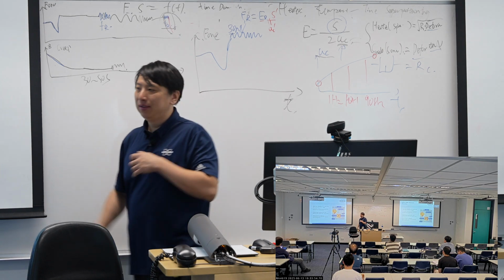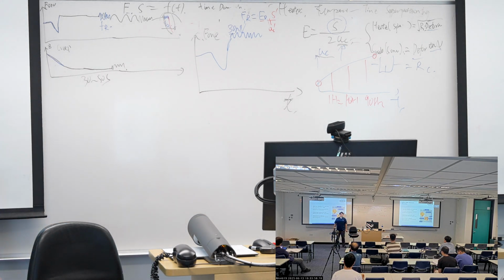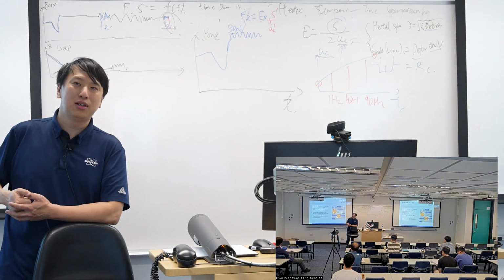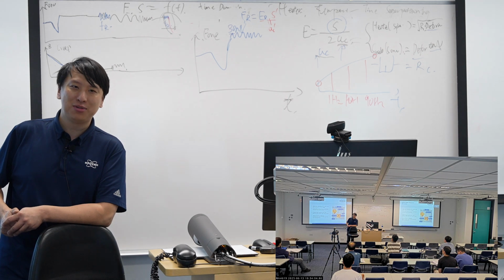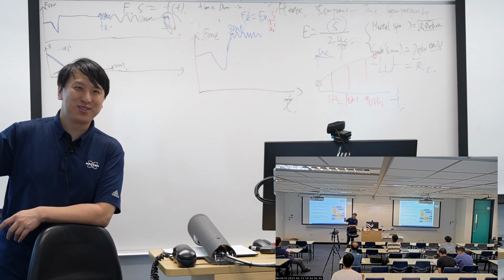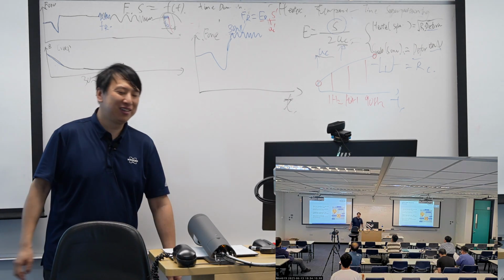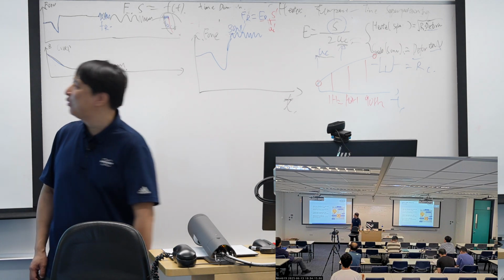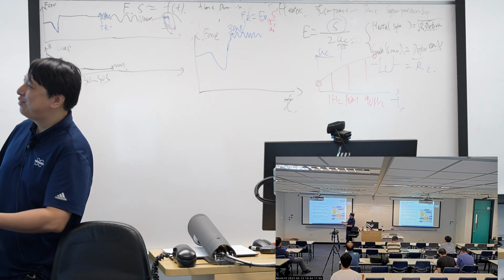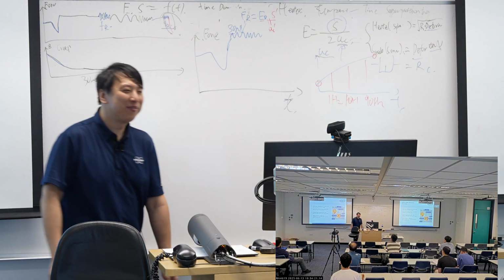So this nanoDMA has to be done on a so-called Bruker's MirrorView platform. I'm sorry, I have to say that platform is relatively quite slow. So it's not as fast as the other workspace. So this afternoon you need to be somewhat patient when you're facing the MirrorView.